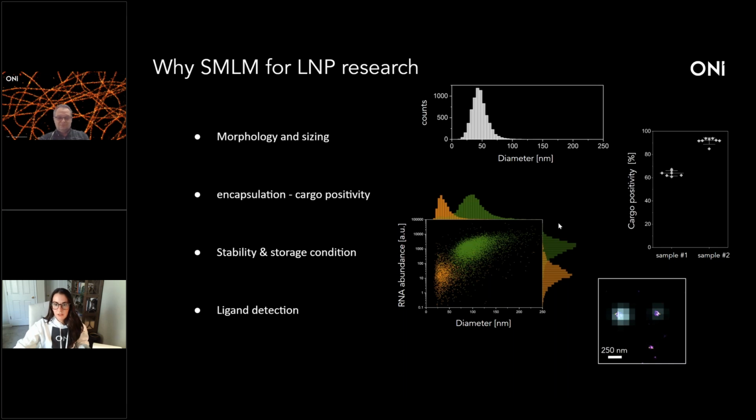Excellent. Okay, next question. What format do my LNPs need to be in for this workflow? Well, it's a good question, because most of the time, different companies or different labs have different LNP compositions, and also the storage conditions are different. So some people use Tris buffers, some people use PBS, some people use sucrose at different concentrations.